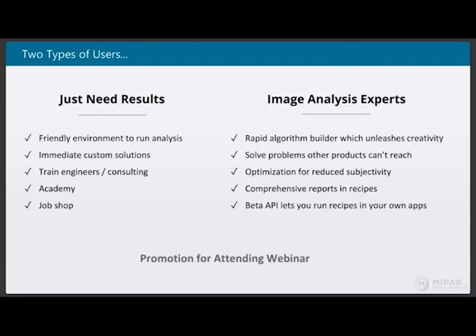I think there was a question on the maximum pixel size of an image that we can open, and again, it has to depend on the hardware of every computer. You have to be able to load the images into memory and then be able to process them further. But it's not something we can say for sure until we see the exact scale of the images you're working with. There's a question on can we open VK4 images from Keyence?